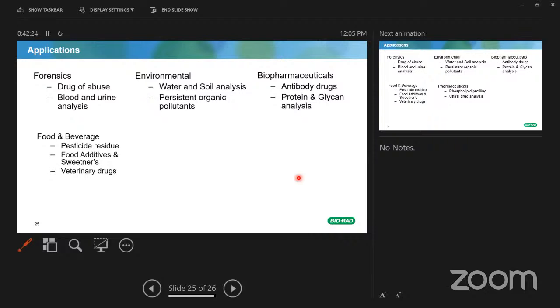Food and beverages, again, is a very key segment where this technology is being used in terms of pesticides. We heard about the hue and cry about Maggi 4-5 years ago, what are the things there in the Maggi, the pesticides being there in Coca-Cola. How has it been analyzed? It is with the help of either HPLC or GCMS. So whatever sample is there, the unknown or very minute quantities are analyzed with the help of these two platforms, the LCMS or the GCMS.